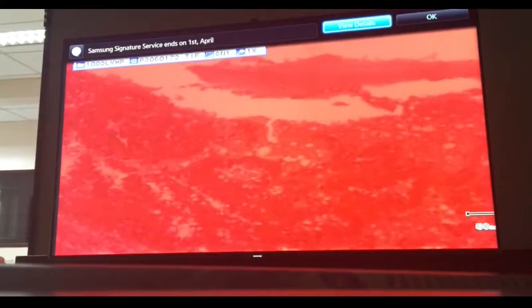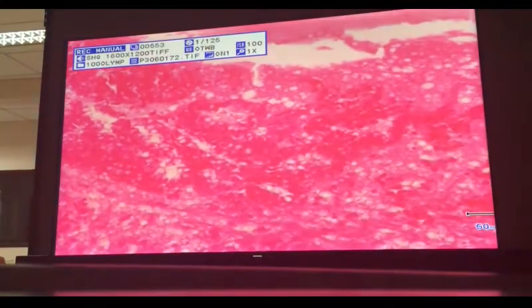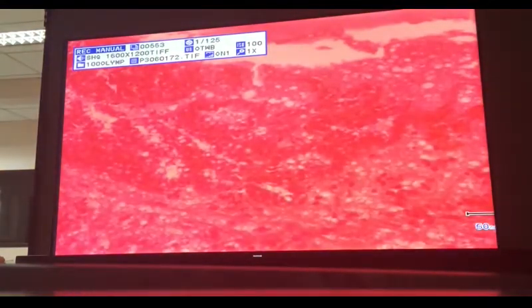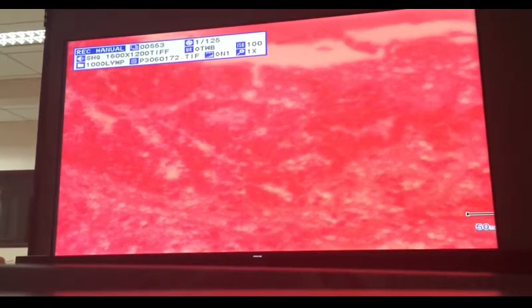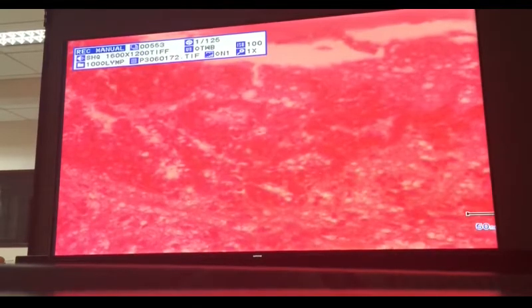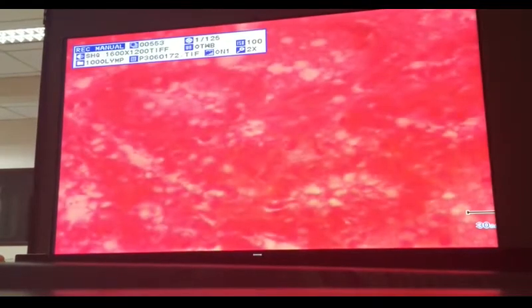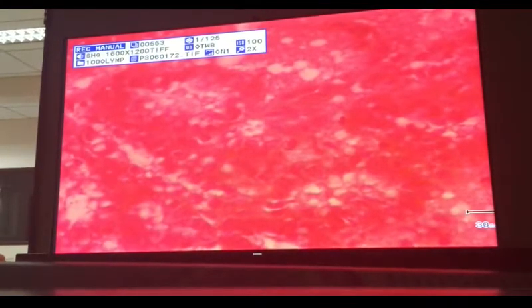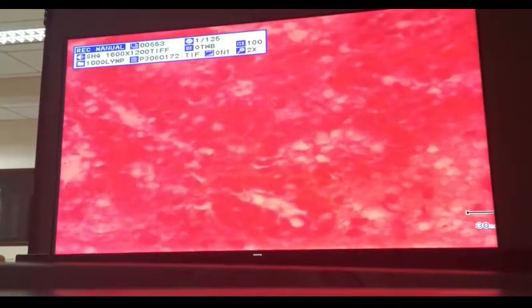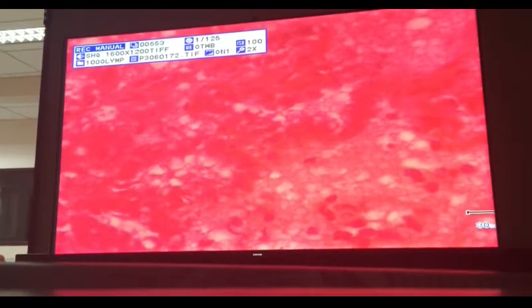Now, shown now is one lobule of acini. Okay? The acini, being the secretory portions, are lined by simple columnar epithelium. Fortunately, the stain is very faint already. Okay, so that is one acinus, another acinus within a lobule. So those are the columnar cells comprising the secretory cells.